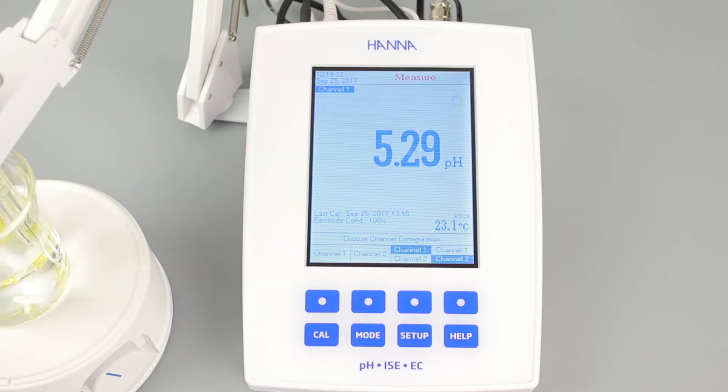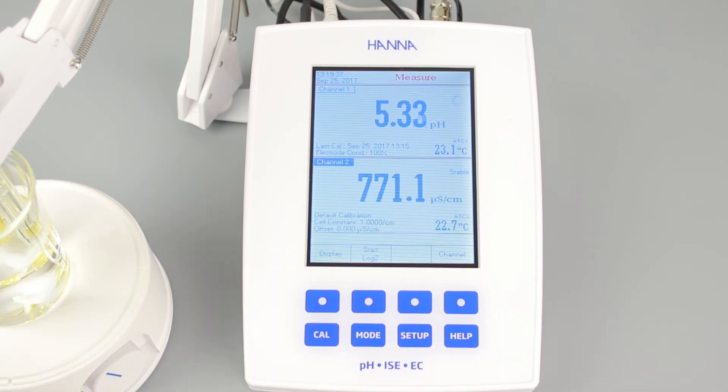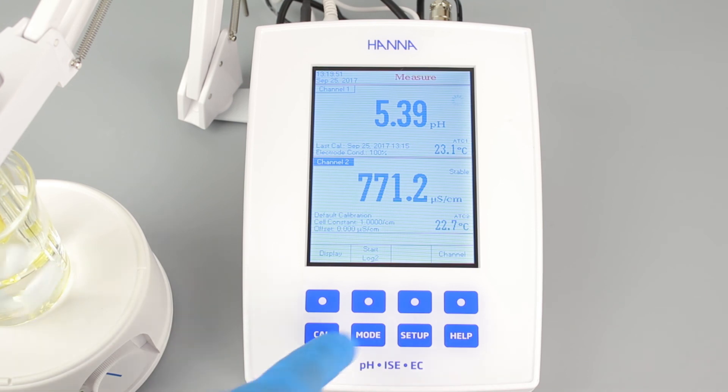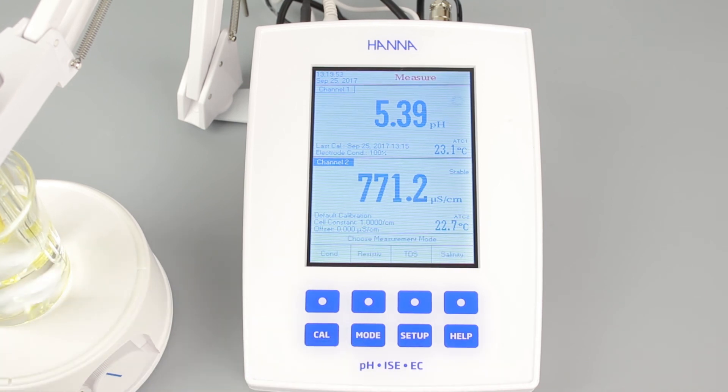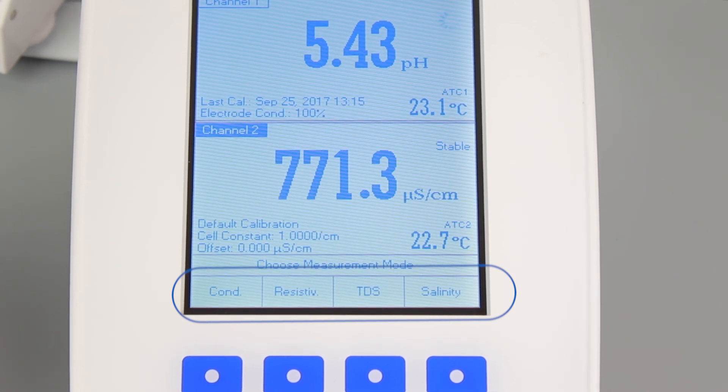Pressing channel and then one of the dual-level display buttons will let you see both readings at once. When viewing EC in two-channel mode, press MODE again to switch between conductivity, resistivity, TDS, and salinity.